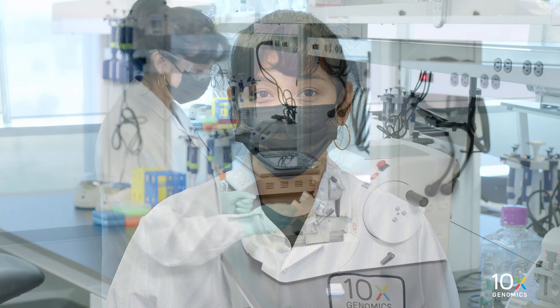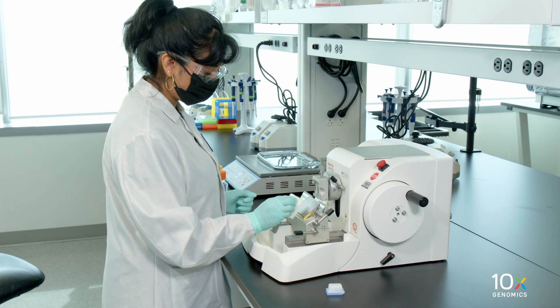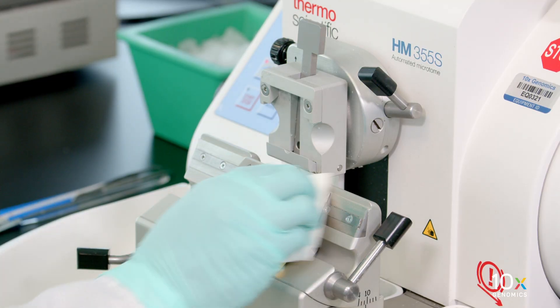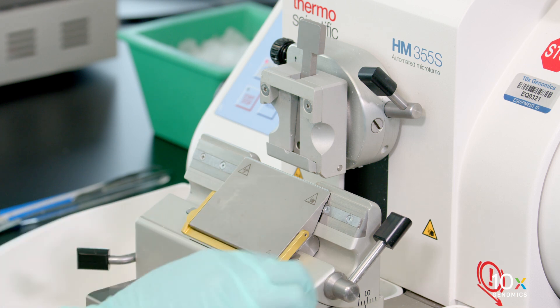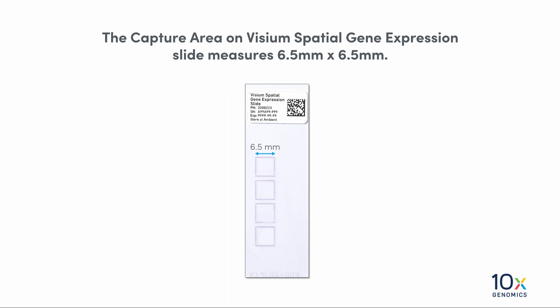We are preparing to score the FFPE tissue block. Before starting, wipe down all the surfaces and work areas with RNaseZap RNase decontaminating solution. The capture area on the Visium Spatial Gene Expression slide measures 6.5 millimeters by 6.5 millimeters.